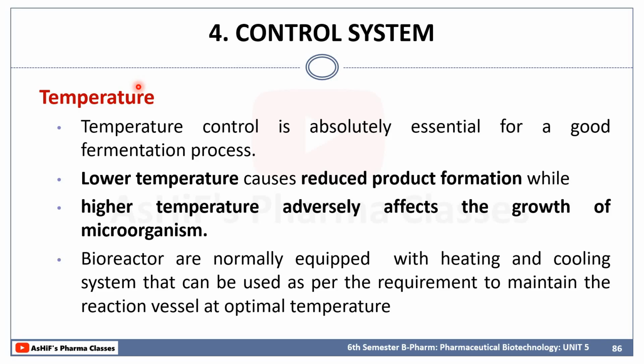So as the temperature increases, microorganisms get killed. So what will happen? There will not be any further fermentation process. But what will happen if there is a lower temperature? It will reduce the product formation. So we have to keep the temperature in between these two levels. It should not be too low and it should not be too high.